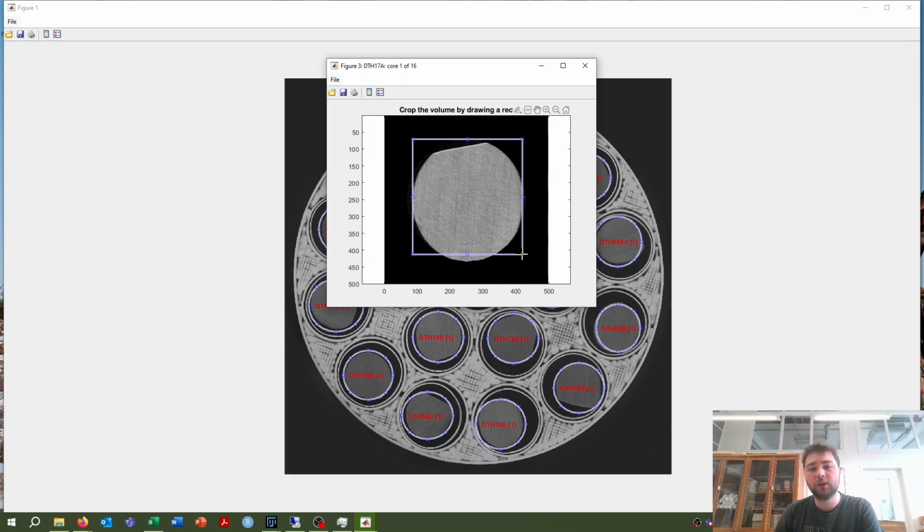And so here you crop the volume as you wish. What I usually do is just crop some of the edges off so that you have a lot of core. It's always the most important that the center of this imaginary cross is nicely in the middle of your sample and that it always has sample.